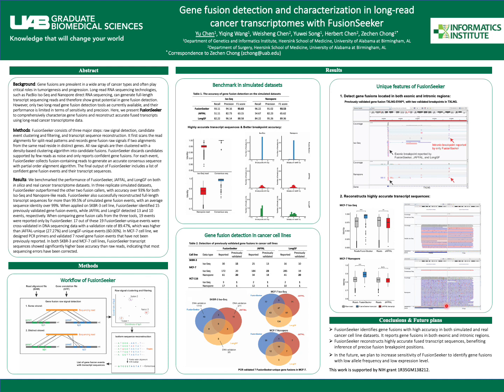And similarly, in the nanopore dataset, we also have a lot of sequencing errors here, but not really in the transcript sequence reported by FusionSeeker. So that means we do have a higher accuracy, especially the base accuracy, in FusionSeeker's result.